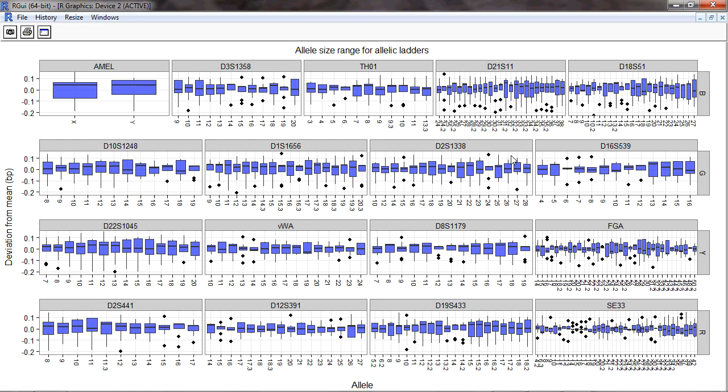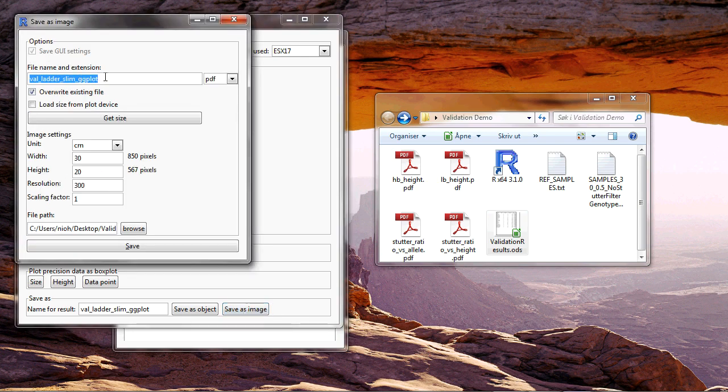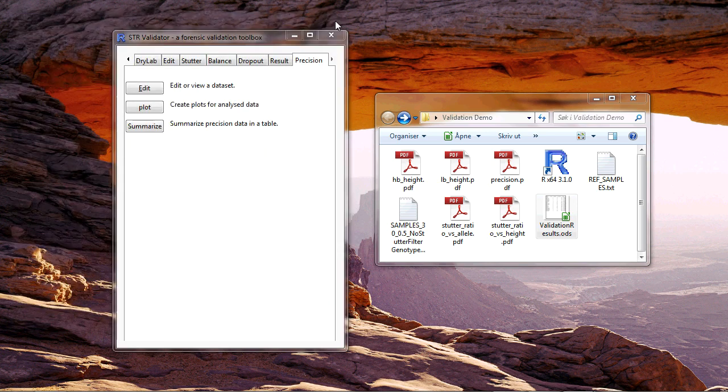Okay, so I'm more happy with this, so I will save this image as precision, and save. And I will close this.